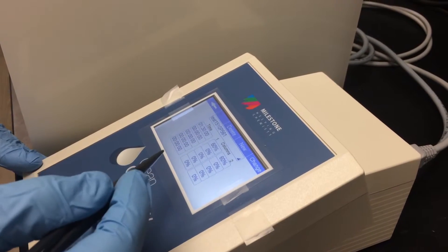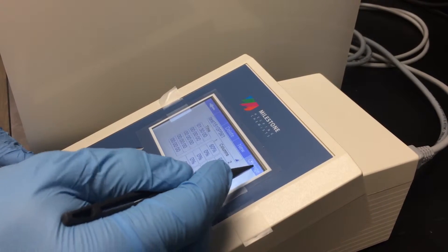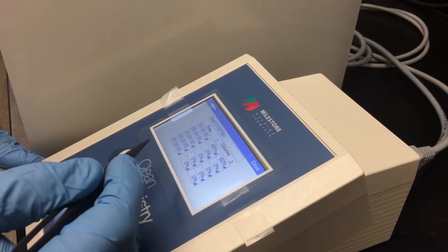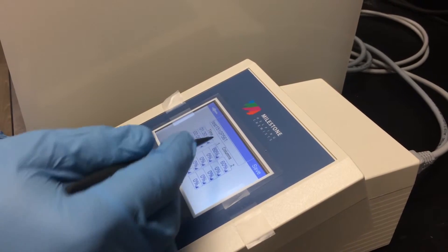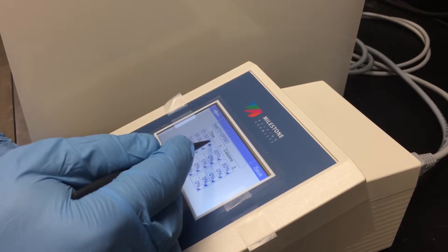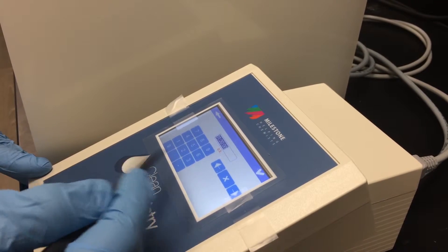Now we're ready to enter in our program and begin our distillation. To program a new method we select the change icon from the top right. Most distillations will take between an hour and one and a half hours so we can change that program by selecting this box here.